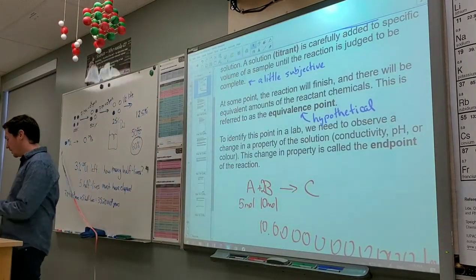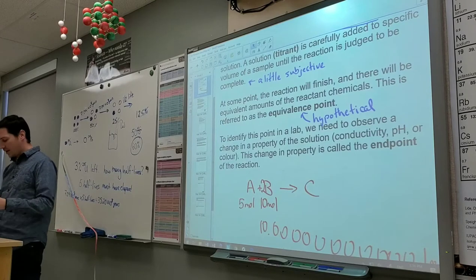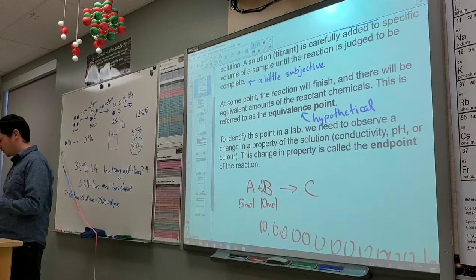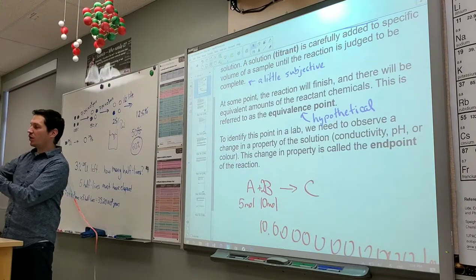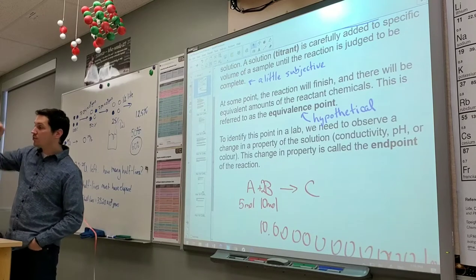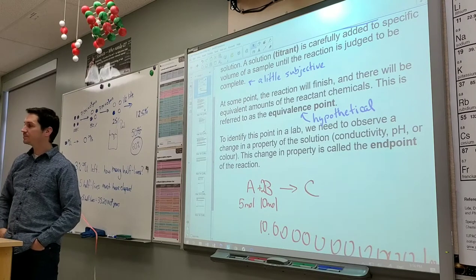All you would have to do is, I'm going to add this to the... And I'm going to fake it like I'm adding more base in a perfectly quantifiable amount when I'm not. So what you would do is you would stick your pH probe in here, right? You'd stick your pH probe in here, and then instead of going really, really, really fast, you would just go, drip by drip. Drip. No.